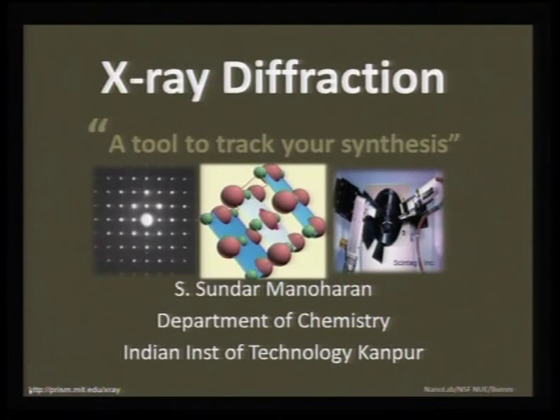And I have specially singled out X-ray diffraction measurements as a very important tool which stands very different to other characterization tools. The main reason: there are other characterization methods which are post synthetic approaches. You make a material and then you try to characterize it after you have processed it. But X-ray diffraction is used not just to characterize what you have synthesized, but during the synthesis itself, much like infrared spectroscopy or NMR spectroscopy, which is actually used in any chemistry lab to map your synthetic strategy.